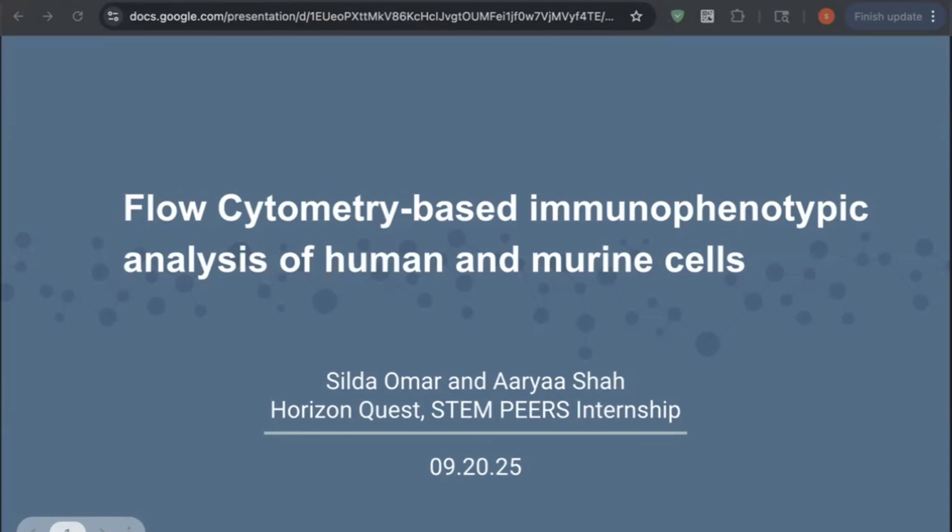Our summer research project was structured to answer the central question in immunology: how could we use the powerful technology of flow cytometry to precisely identify and analyze the different types of cells? To address this, our program was designed as a progressive journey moving from foundational theory to practical applications. For the first 2 weeks, we focused on building our theoretical knowledge of flow cytometry and immunology through in-depth literature review and comprehensive training on CellEngine analysis software.